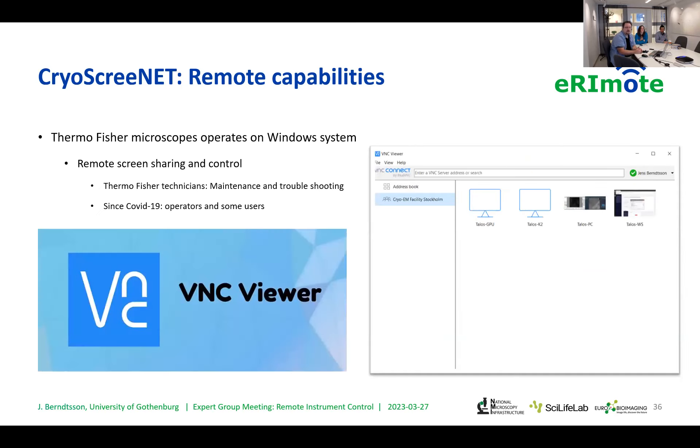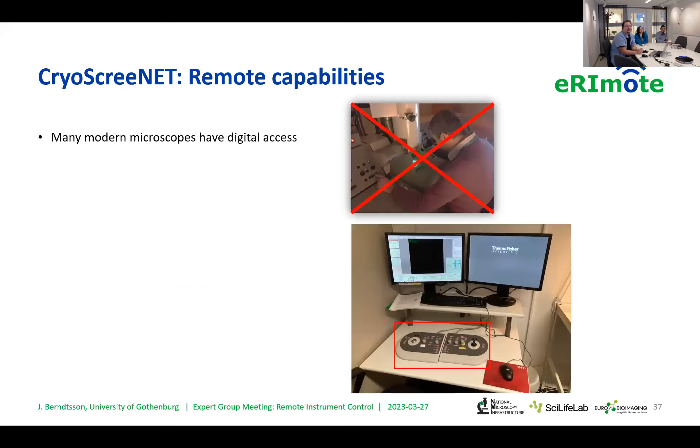Erin mentioned a few computer programs she uses. We use something called RealVNC, which you can access with the VNC viewer tool. Unlike no-machines, VNC viewer does allow you to look at multiple screens at the same time — that's one thing I didn't know was a problem for no-machines, so maybe that's something for you to investigate. This is now how our workstation looks, and we have digital access.